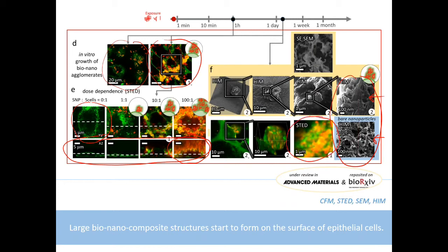Like here, in this super resolution light microscopy image, you can see that the membrane and nanomaterial build a sort of composite that is now located on the outside. So the cell obviously uses membrane material to quarantine the nanomaterial used in this study. This is how it survived very large doses locally.